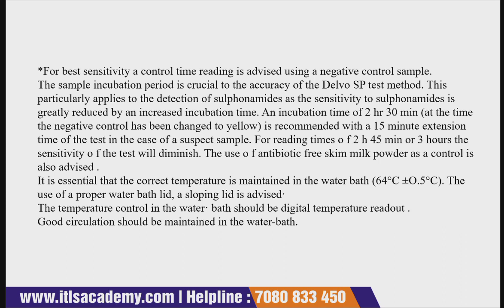Secondly, it should be properly sealed after you pour the milk and the nutrient tablet. Then the temperature should be properly controlled, meaning there should be proper temperature control. The water bath temperature should be correct.